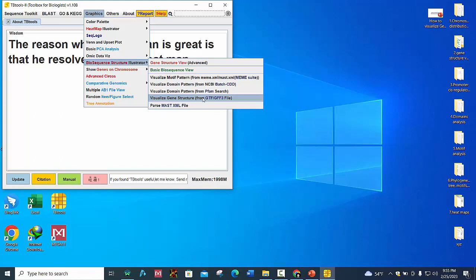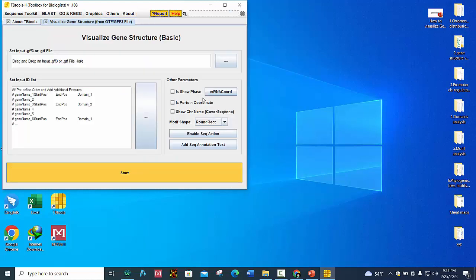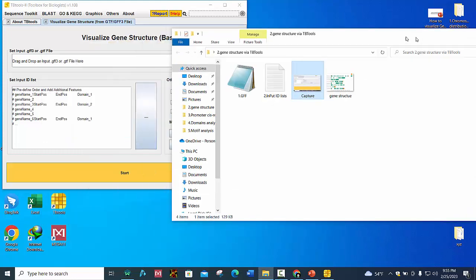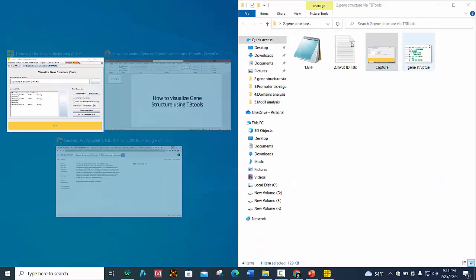Click on it. Here you can see two files are required to visualize gene structure. First is the GFF or GTF file, so we will drop this file here.